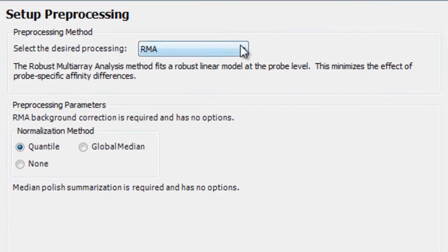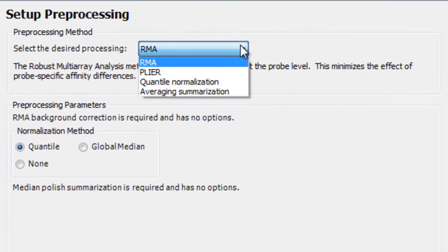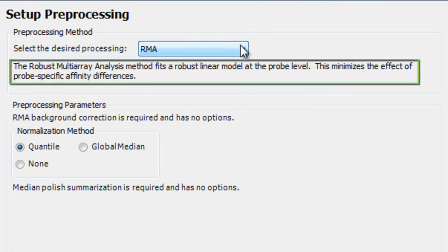Normalize your data using RMA, Plier, Quantile, or the Averaging Summarization method. If you aren't sure which method to use, the Project Setup Wizard guides you through.